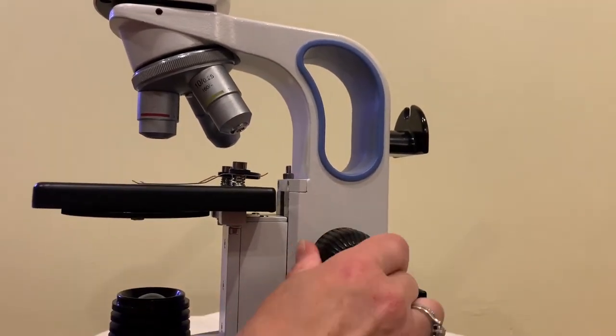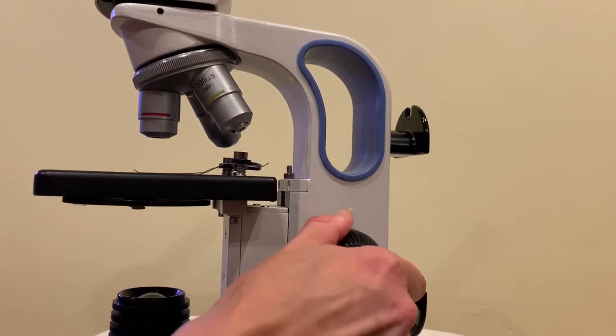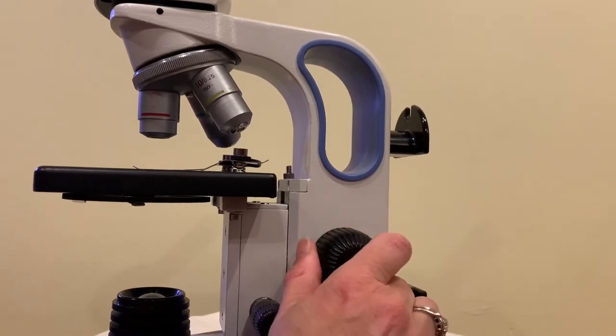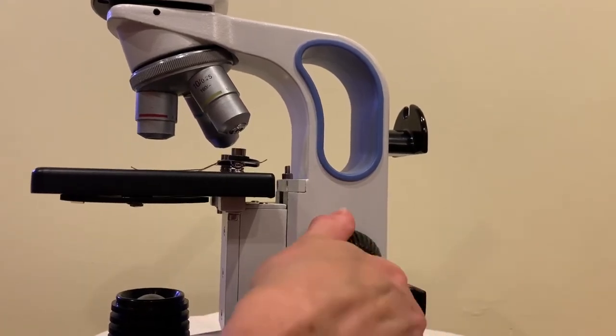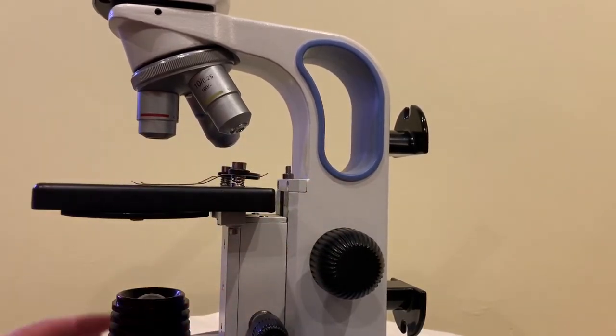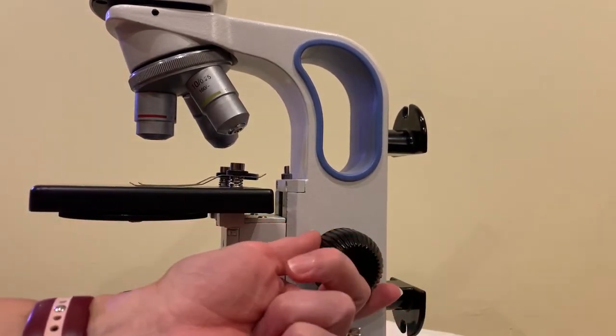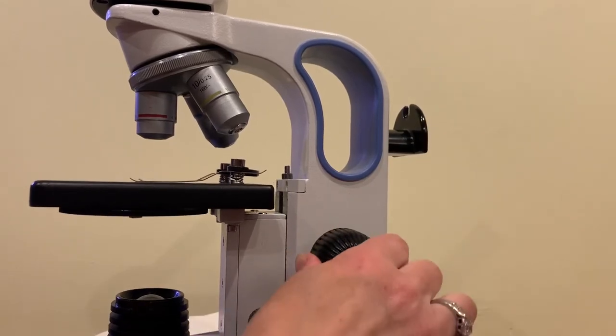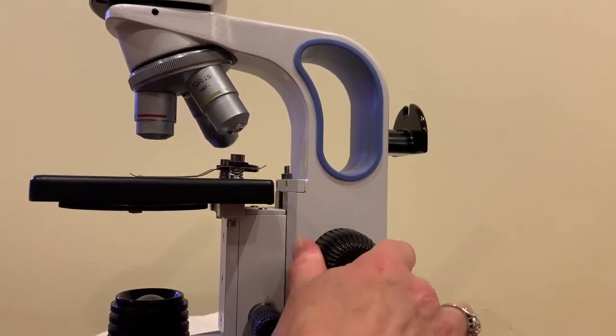Now we come to the coarse focus knob. So what do you notice is happening when I turn the coarse focus knob? Very good. The stage is moving up and down and it's moving up and down quite a lot. When you first put your slide on the stage and you've turned the microscope on and you're on the lowest magnification, in order to bring your sample into focus you are going to use the coarse focus knob. So you're going to turn it until whatever you're looking at comes into focus.